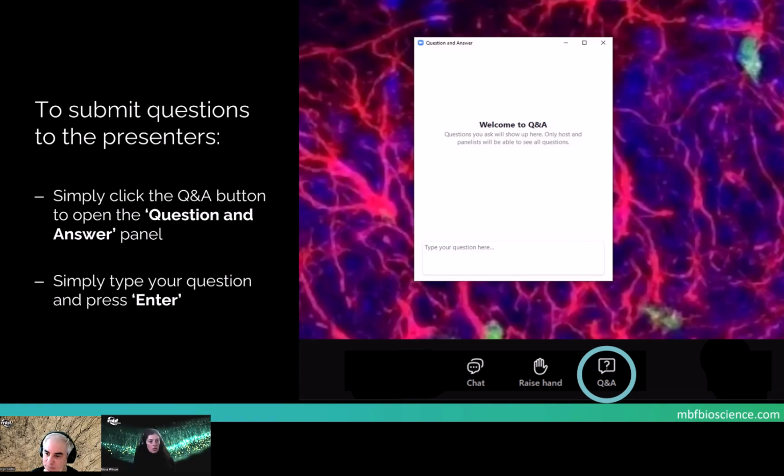And there is a question about new classifiers that we're working on or classifiers that we plan to add. Definitely our big focus, like Jorge mentioned, is bright field. And then outside of that, it's what is requested. So like I said before, we'd love to see your images and hear from you what you would like to count. So we want to work with you to develop those new classifiers.